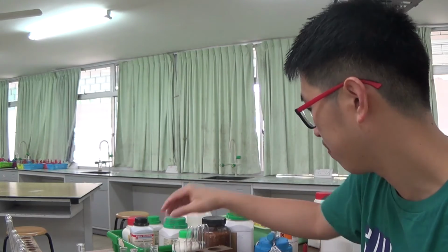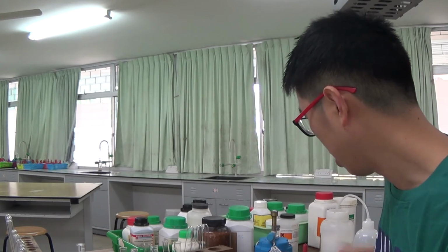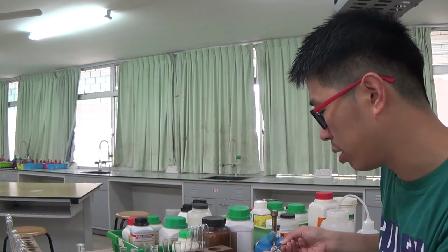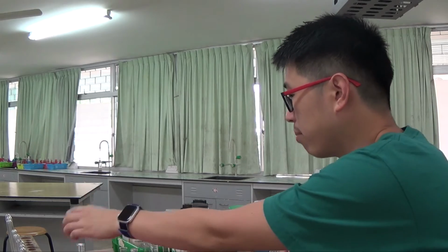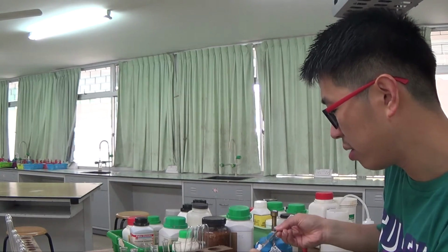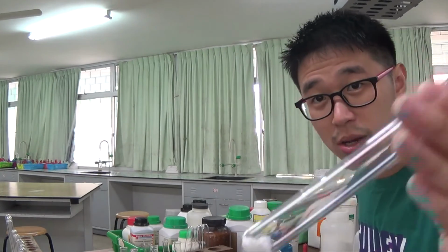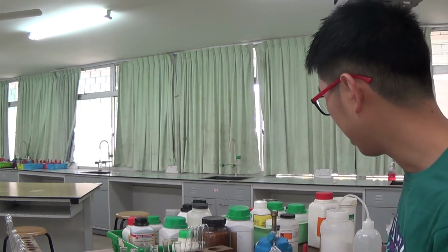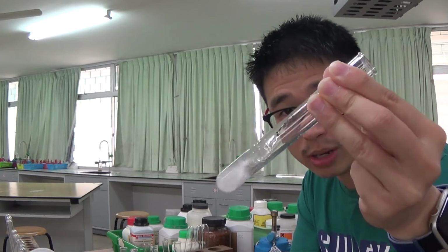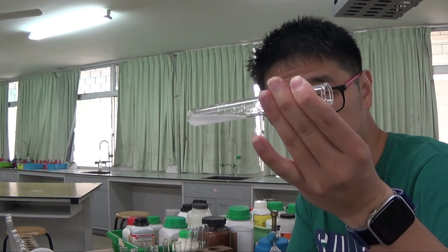Okay, so that's why, as center supervisors, we all need to be careful to really prepare the solution according to Cambridge standards. Okay, because Cambridge knows at what concentrations they will give you the result. So just now, even though it contains aluminium ions, they are not very visible. So I'm trying to dissolve a lot more of the solid to try and get a lot more concentrated solution. So I'm preparing the solution from scratch, right? So I'm not making a stock solution like what Cambridge asked me to do. That's usually what the lab tech will provide for you.